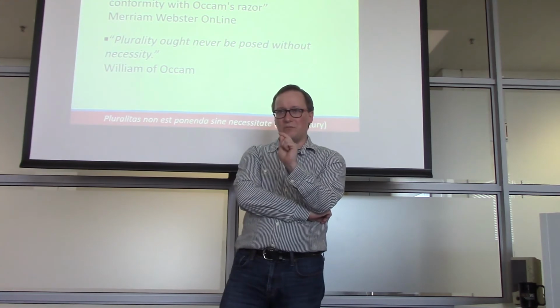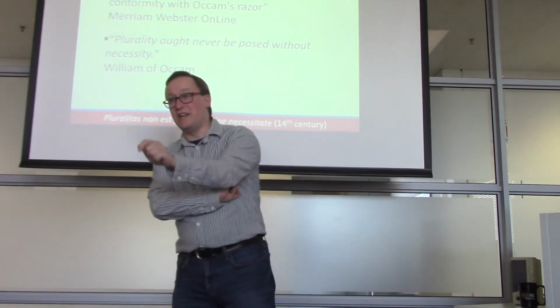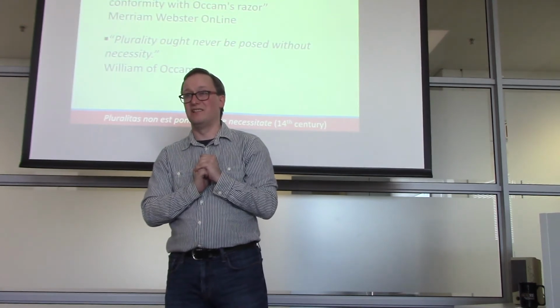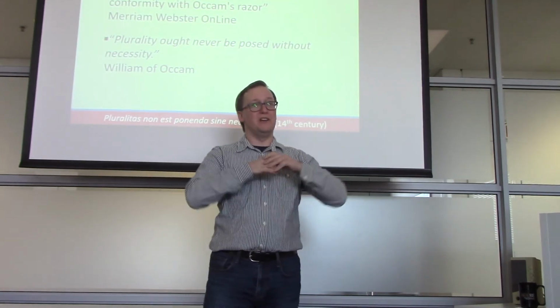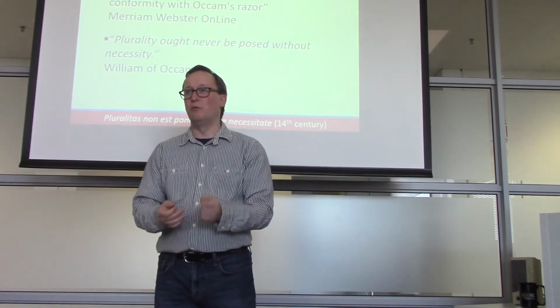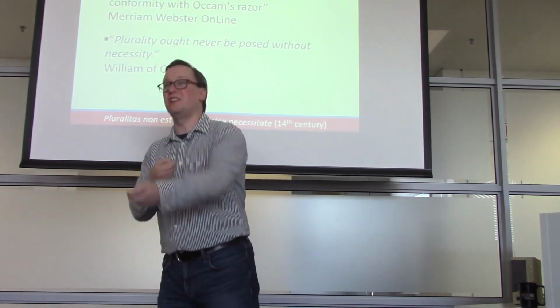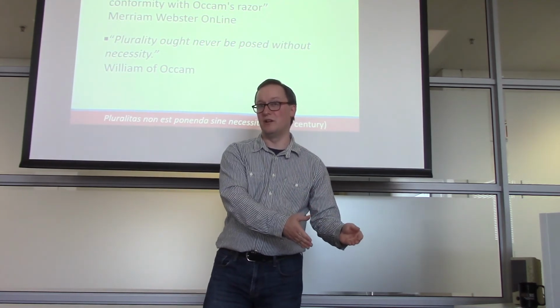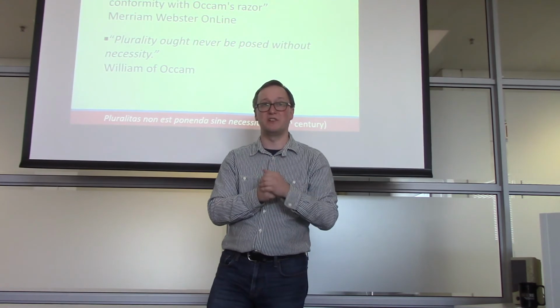In parsimony, we never want our explanation to go further than our data can take us. All right? So when we are naming what set of proteins we've identified from a sample, we don't want to spend more proteins than we must to explain the peptides that we've observed. That is a parsimonious principle.